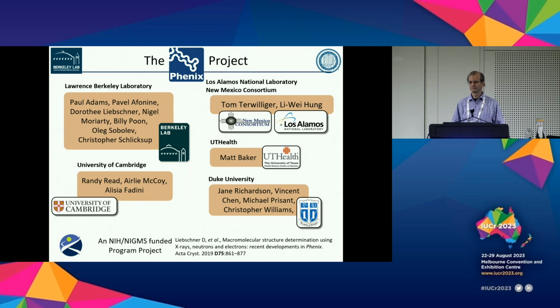And then part two is, I know you can do an AlphaFold prediction without templating to the PDB. So if you come with a sequence that maybe has homologs that, long back, we would have made a homology model, yada, yada, but that's always biased towards the deposited structure, is an AlphaFold prediction in absence of the PDB a better model than a templated structure?